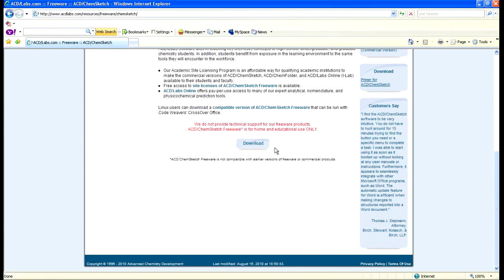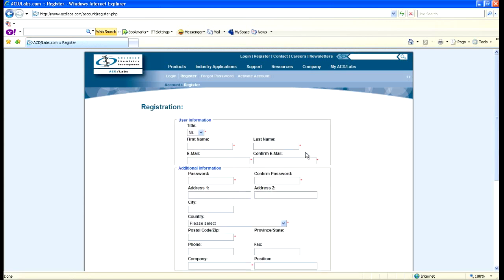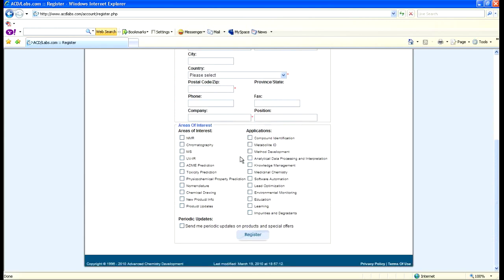Your download link will be at the bottom of the window. The first time you come here, it's going to ask you to either log in or register, so you'll want to create an account. Fill in the required fields — basically your name and an email address. They will then send you an email confirmation. Click on the link in the email and they will activate your account. You can then come back to the webpage and go ahead and download ACD Labs ChemSketch.